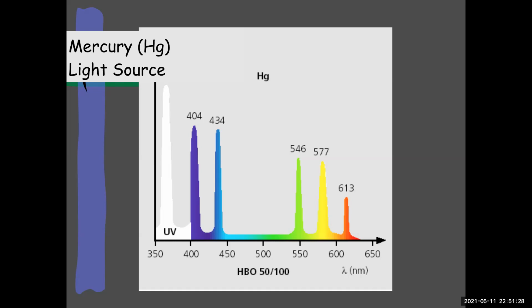It's called an arc lamp because there's an arc of gas that sparks the color. So you send electricity through gas and get light from that. So there's actually a spectrum to know about your arc lamp. And if you're doing anything quantitative, it becomes really important. If you're just doing qualitative, like, let me see what there is to see, is there a signal, yes, no, then you're okay.